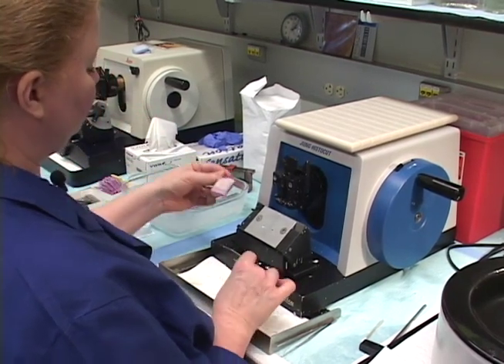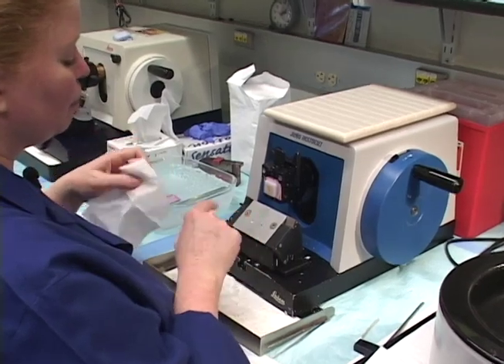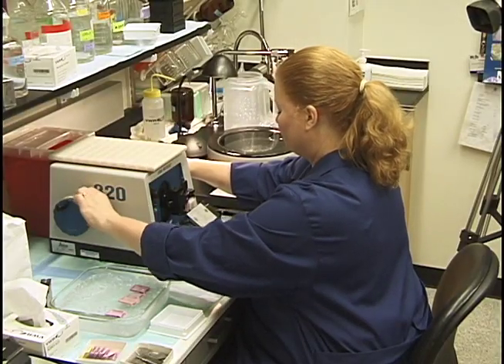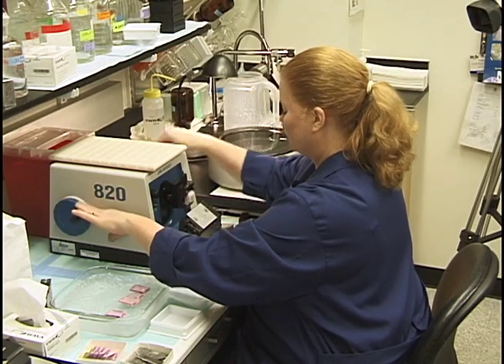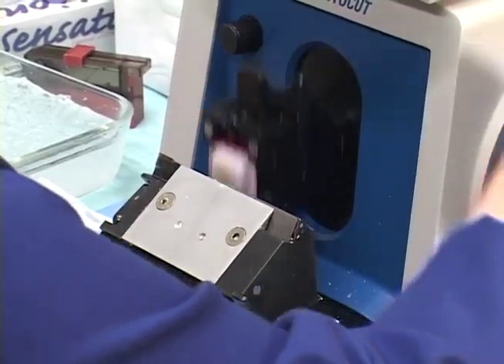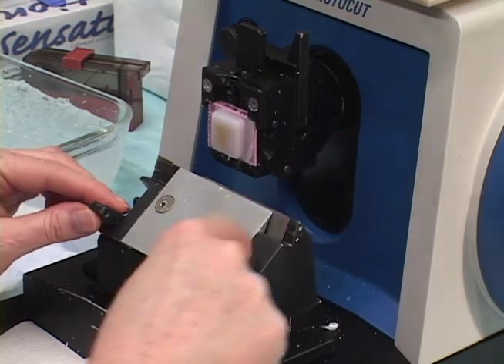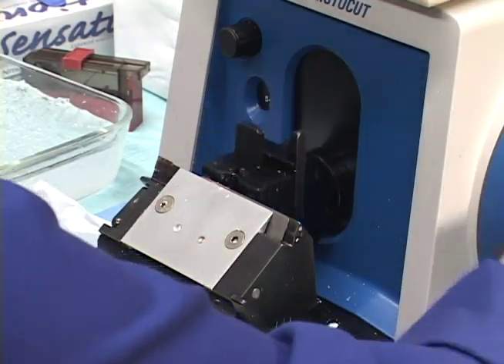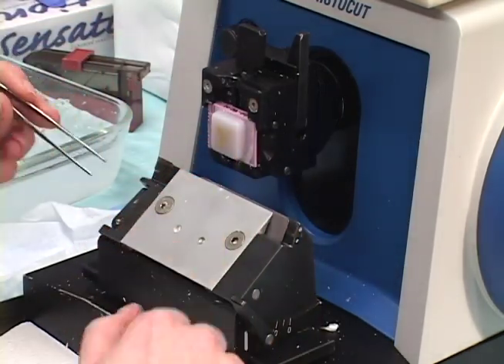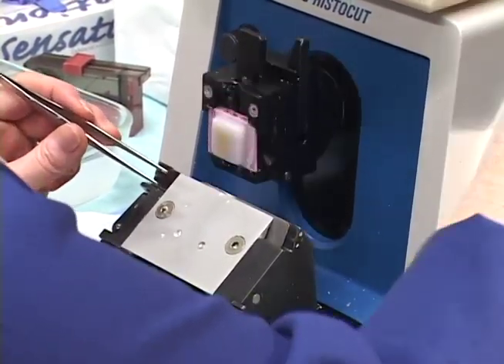We'll start with our testes tissue. It's got a little water on the front that can interfere when trying to pick up your ribbon, so I'll just blot it off with a Kimwipe. I back it off the blade, bring it forward slowly until I'm close, then stop and do full turns. I have forceps ready — don't use your fingers, you can cut yourself very easily. Using your fingers is a bad habit that a lot of old-time technicians have.